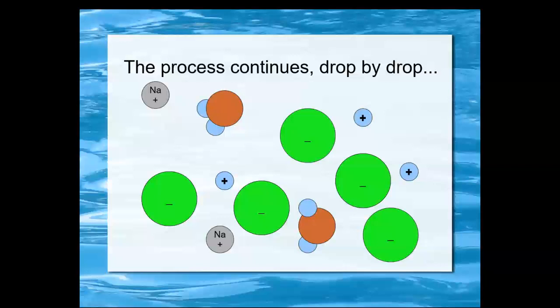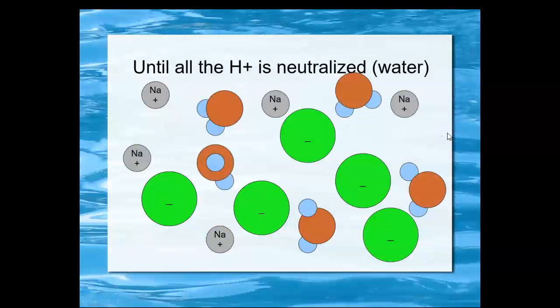When we add the second drop of sodium hydroxide, the same thing happens, forming another water, another sodium ion is left behind, the conductivity drops. And then that goes on until all the hydrogen ions have been replaced by sodium ions. And that means in each one of those additions, the conductivity has dropped, because there's the same number of cations involved, yes, but they're bigger and slower.